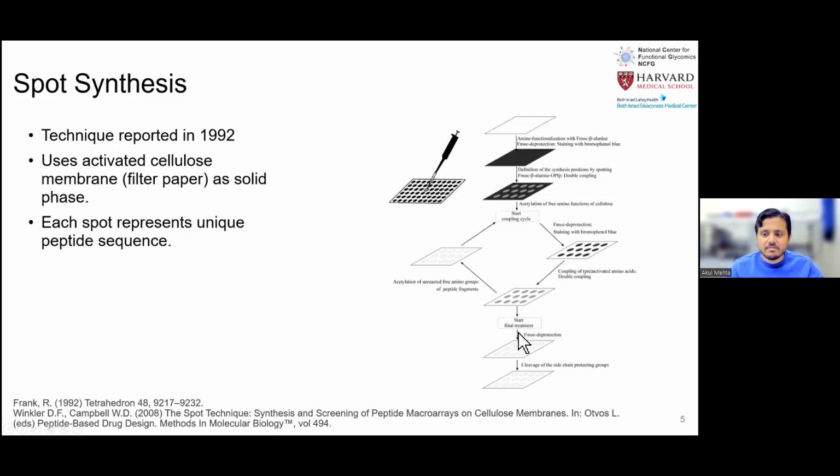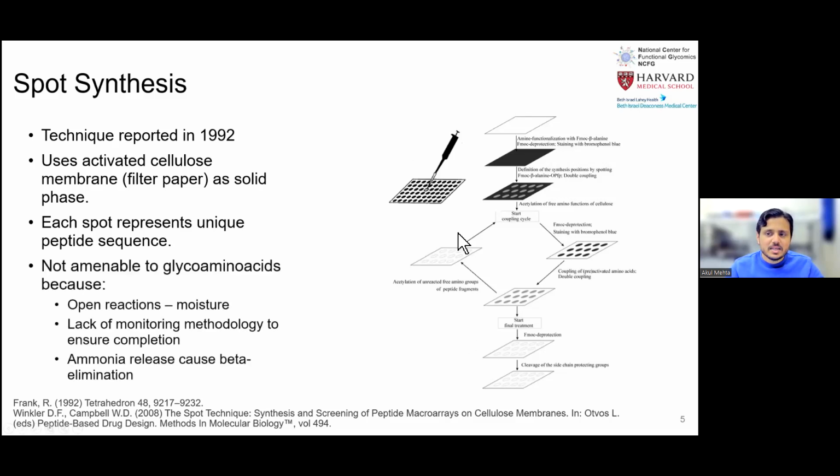And this can finally be deprotected, and the side chains can also be cleaved. And there are actually methods for how to release these from the surface as well. Because if you think about it, it's just an ester bond, so you can quite easily release these from the surface.